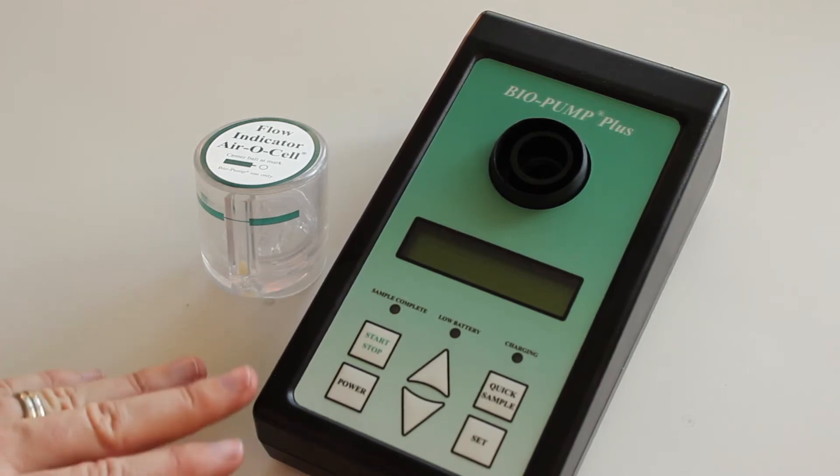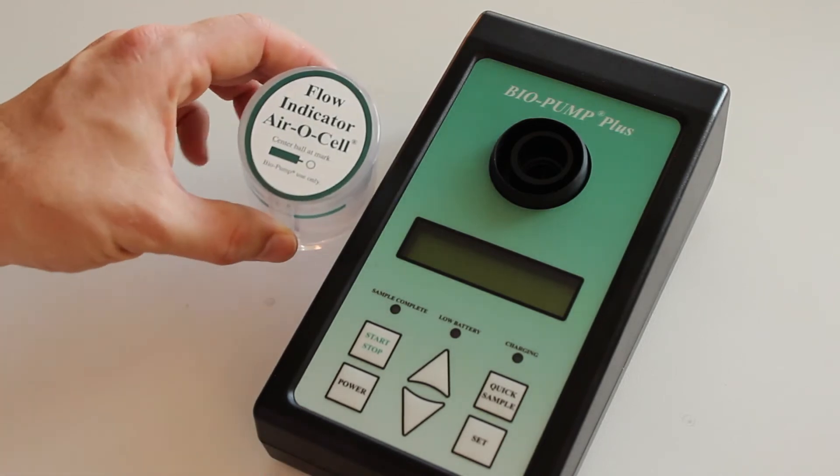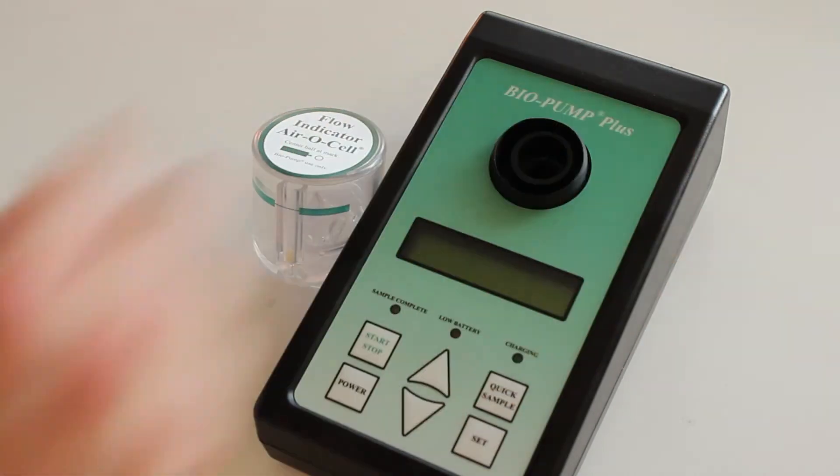You can use this for your Air-O-Cells, Allergenco Ds and such. To check it on site you're given this flow indicator Air-O-Cell which compensates for having the differential pressure of an Air-O-Cell on there so that you get the calibration right.